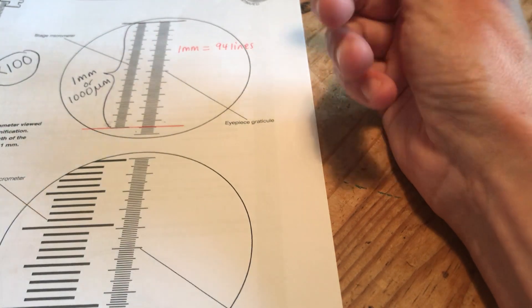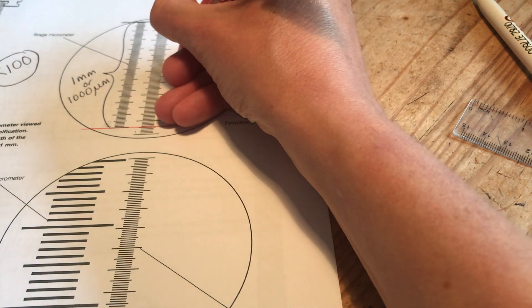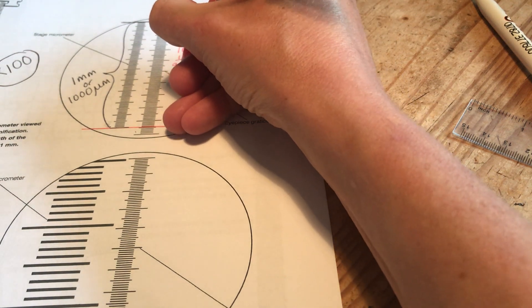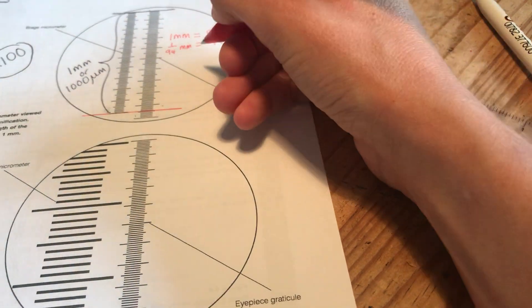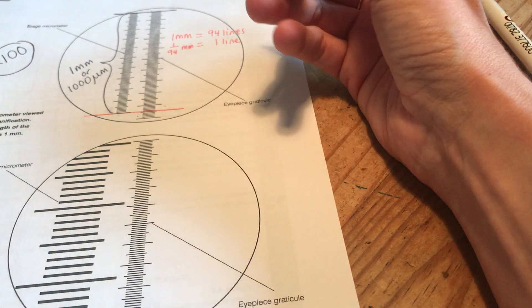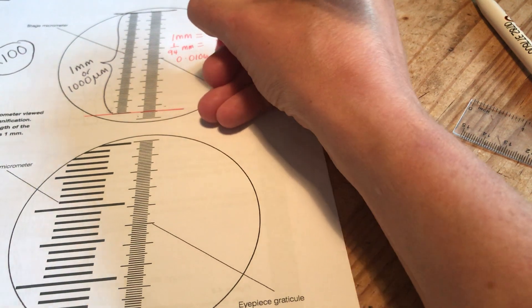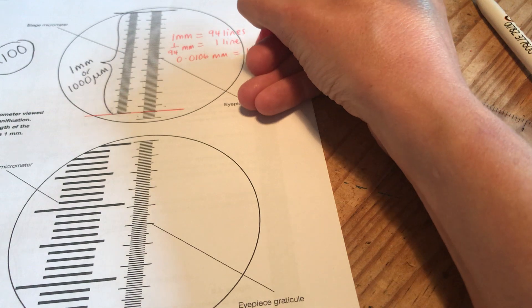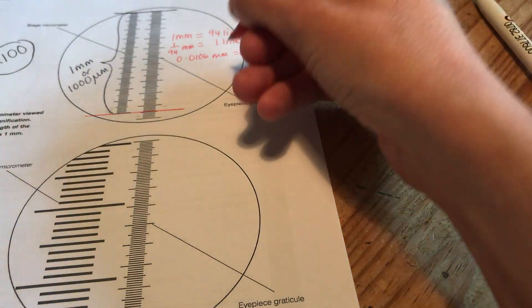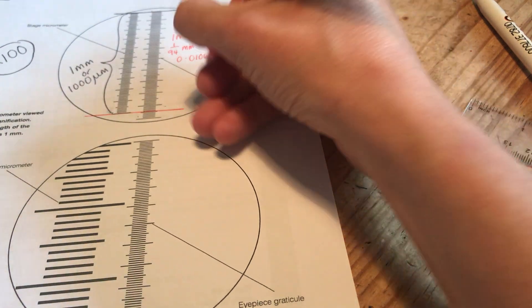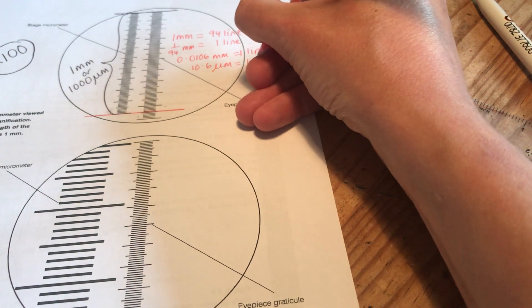Now my job is to work out how much one line is worth in millimeters. So 1 over 94 of a millimeter is worth one line. So if I do 1 over 94 I get 0.0106 millimeters equal to one line on the eyepiece graticule. If I convert that into micrometers to make it look a bit tidy, 10.6 micrometers is worth one line.